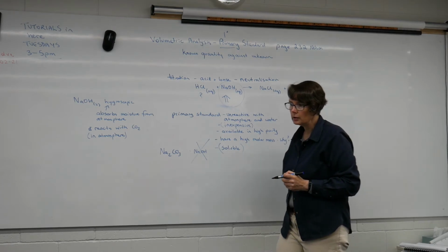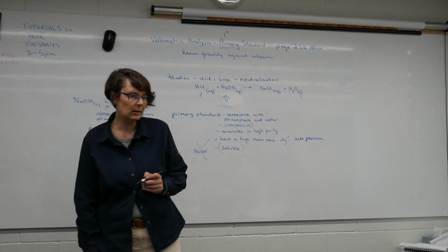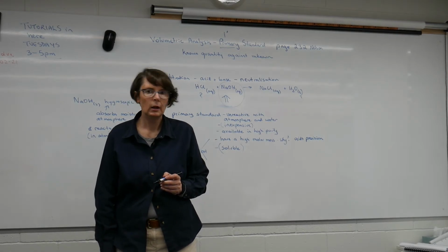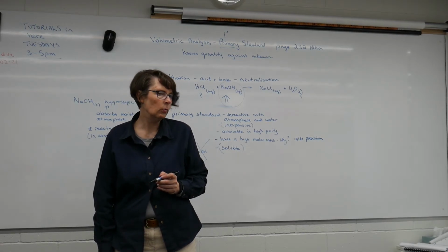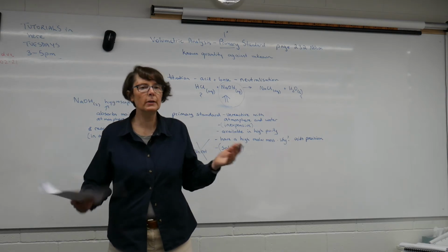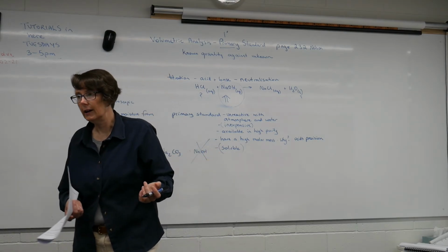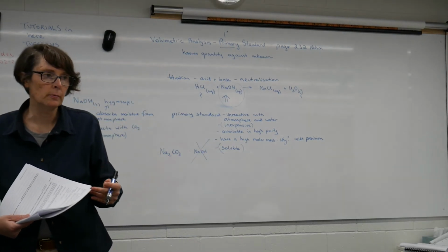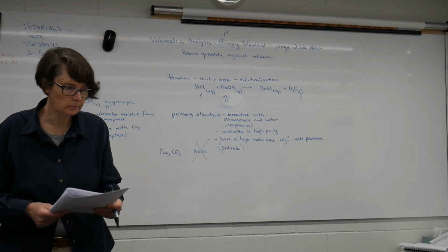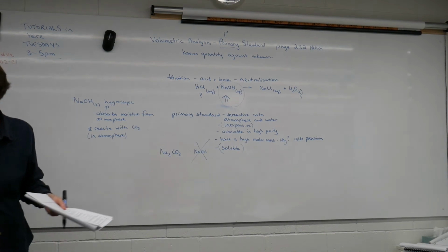If you have a look at your little lumps of sodium hydroxide on your desk, how do they look now? Moist. They look wet, shiny. Yep. So they haven't been out very long, and they're obviously taking in moisture from the atmosphere. The longer we leave them, they'll eventually melt.